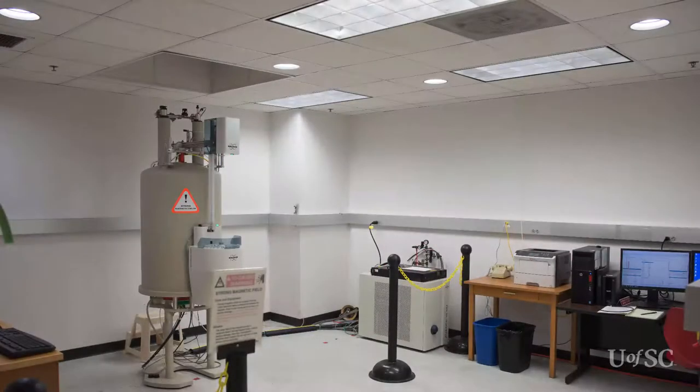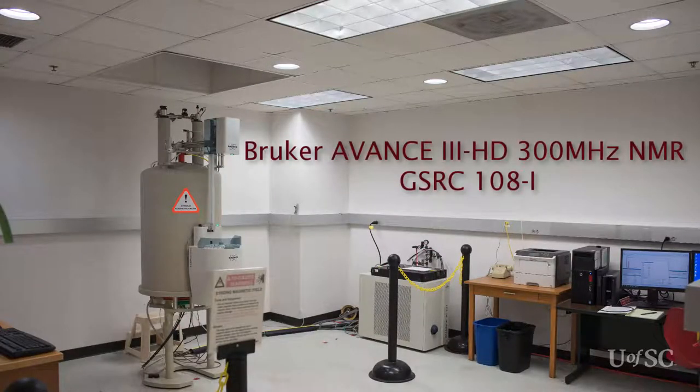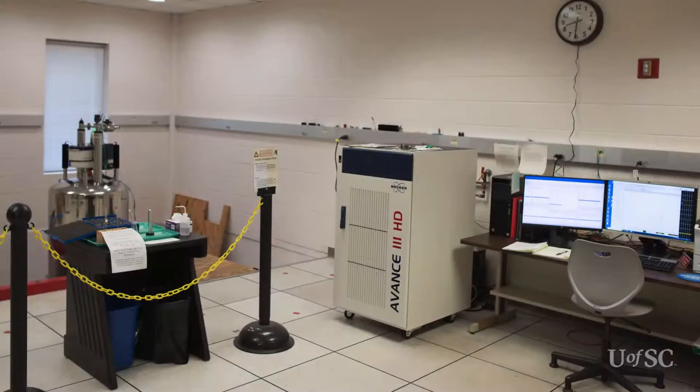These training videos will focus on the operation of the Bruker Avance 3HD 300 MHz spectrometer. This instrument is located in room I in the GSRC 108 suite. This is on the ground floor of GSRC and the entrance to the suite is in the back hallway where you will also find the CAS stockroom. The rest of the facility's instruments are located in room D of the suite.